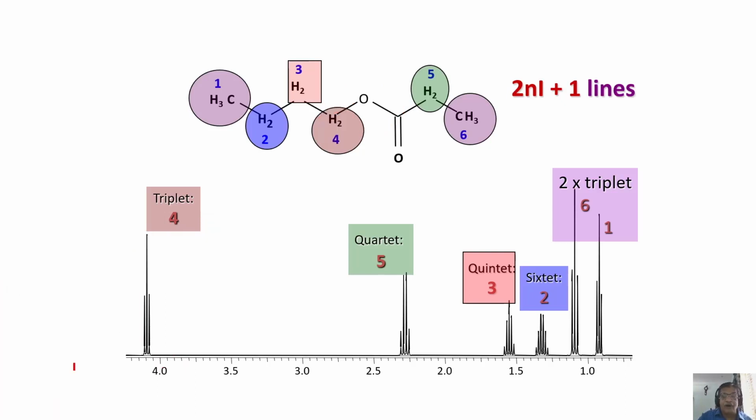I hope you all have understood how to make the assignment. So I am going to stop with this analysis. We'll come back in the next class. Let us see how to proceed further. And if I find one or two complex spectra, I'll show you so that you can get more familiar. And after that, I'll start going to heteronuclear spectral analysis. First, I'll start with the carbon-13 spectrum. You should know how to analyze carbon-13 spectrum and how to get a good carbon-13 spectrum, everything. And afterwards, we'll go to other topics.